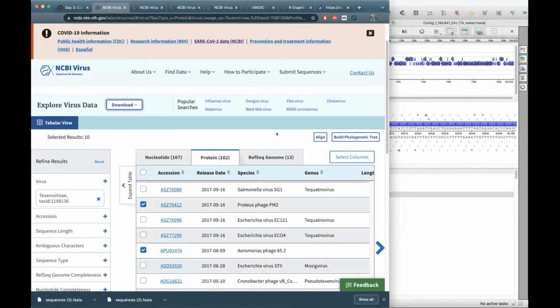Can I quickly ask another question about the selection of the marker? You mentioned it depends on the phage, right? So you recommend going to the ICTV website and looking at the taxonomy proposal for that specific phage and seeing what marker was used, right? For that particular group of phages, if you know broadly what group it is, yes. I see. I'm assuming all the proposals have the same format where you can easily identify which marker was used.